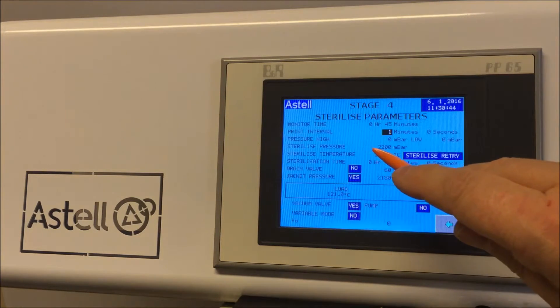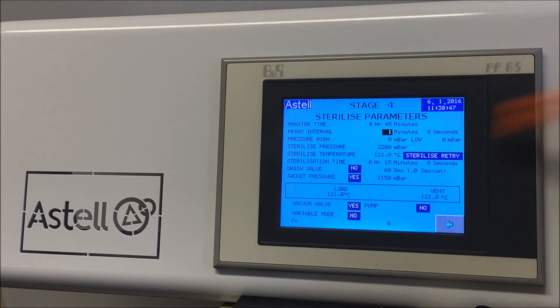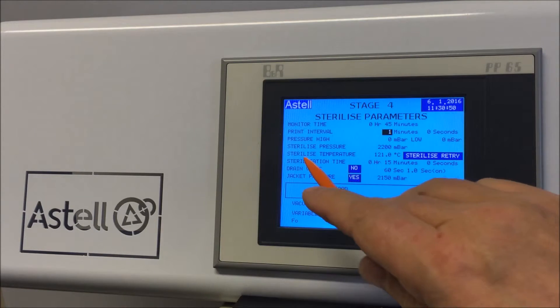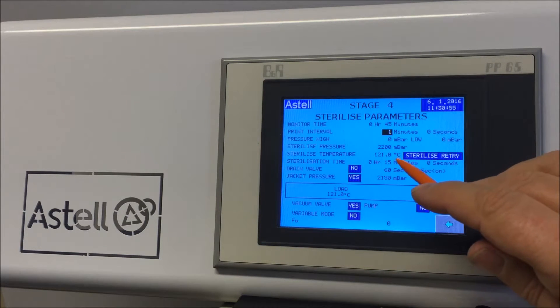Touch the center of the screen. You can now see all the parameters for this stage. The sterilization time here is set for 15 minutes. To change this, for example to 20 minutes, tap the 15.